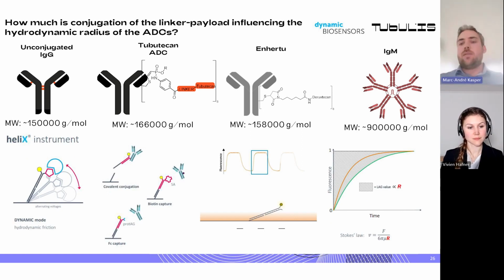And here we see this relaxation, so after the molecules were taken to the surface and they relax, the longer it takes, the larger the hydrodynamic radius, and there's something that was defined by Dynamic Biosensors, which they call a lag value, and this is the area above the curve. So it just means what we need to know for the next slide: the larger the lag value, the higher the hydrodynamic radius in the end, and this is something we do not want to increase.